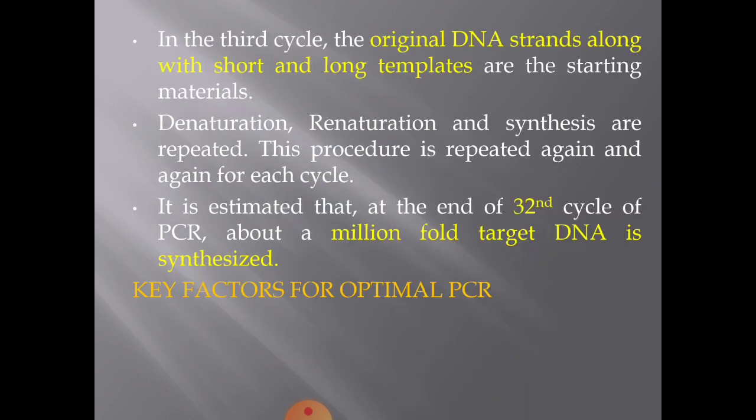In the third cycle, the original DNA strands along with short and long templates are the starting materials. Denaturation, renaturation and synthesis are repeated.